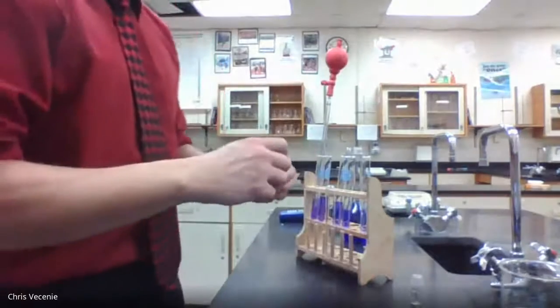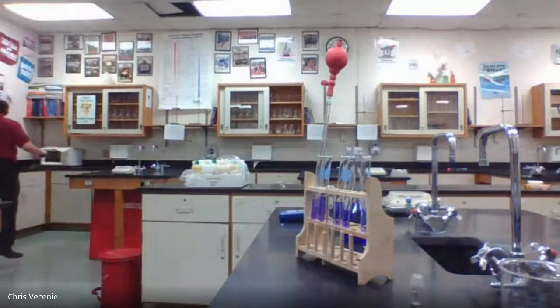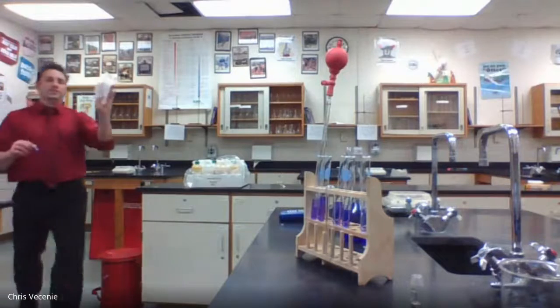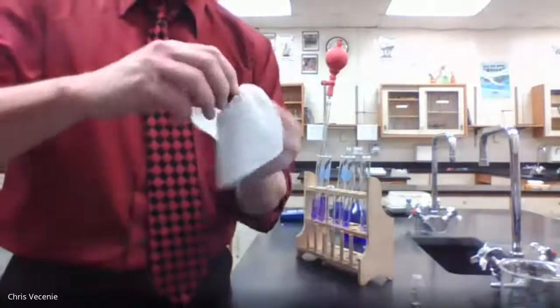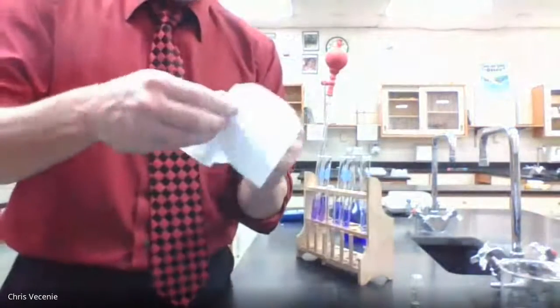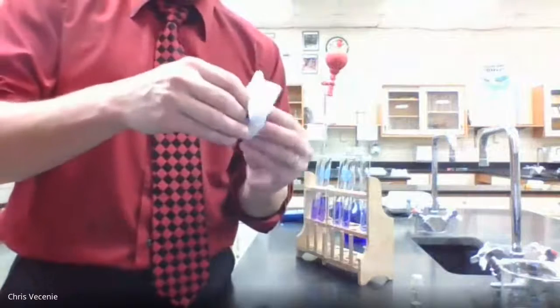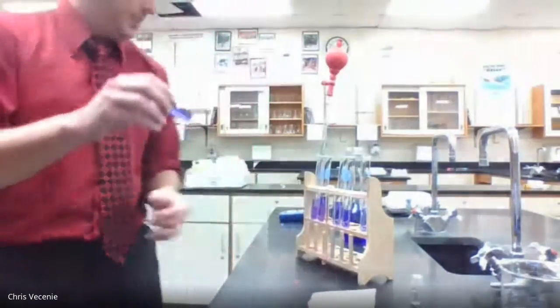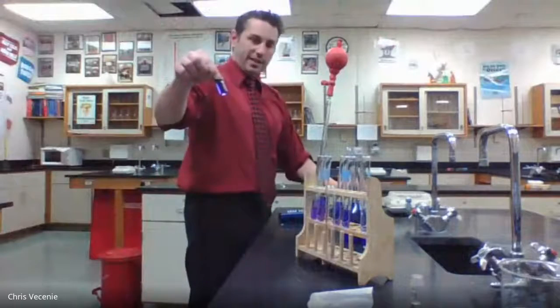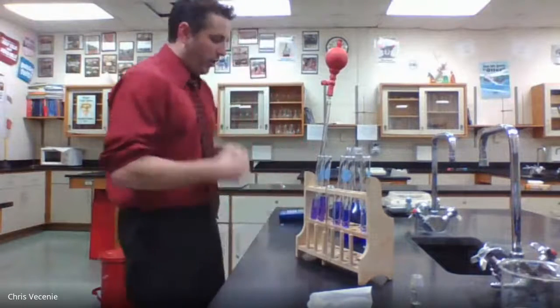Then what I would do is get one of these guys here, which is called a chem wipe, and I'm going to wipe this cuvette down because if I have any fingerprint smudges on this cuvette, that is going to increase the absorbency, and it's going to make me think that the solution is more powerful than it is. So then we would take that cuvette, put it in there, close it, turn it on, monitor, and we'd get an absorbency.